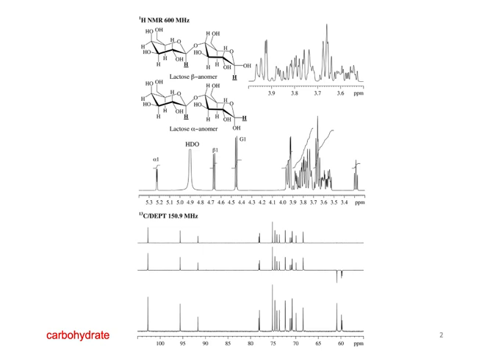We have all of these protons. Almost every proton is on a carbon that has at least one oxygen, right? And so we end up with a big pile of H's that are all very overlapping and makes it very complicated. And this is just a disaccharide.